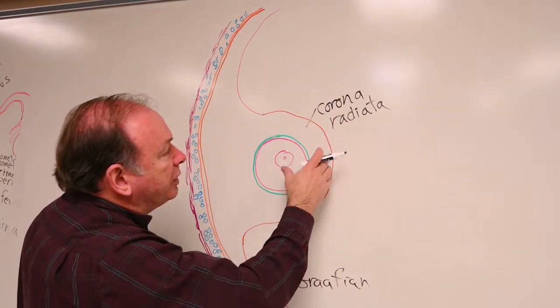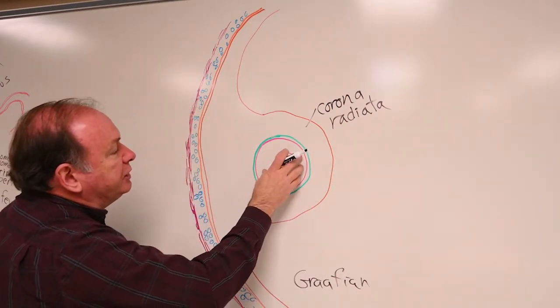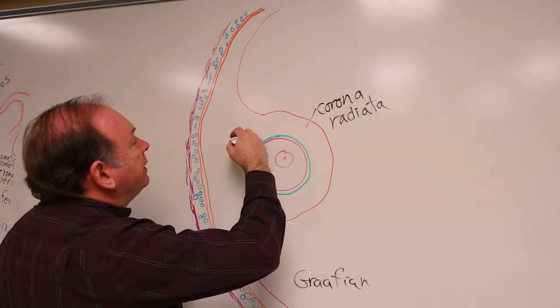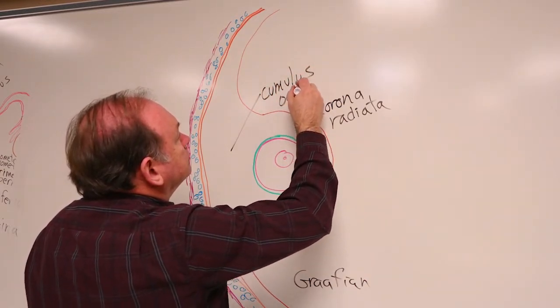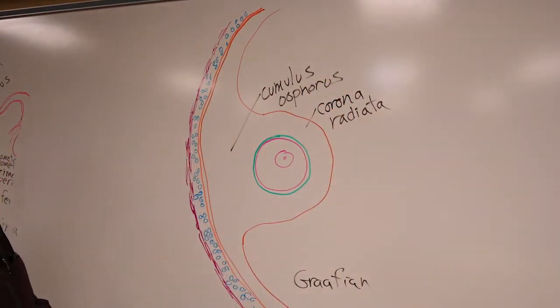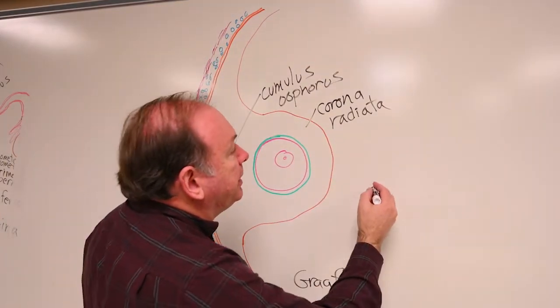That part of that structure of follicle cells they call corona radiata. That region of follicle cells that attaches the oocyte to the follicle wall over here is referred to as the cumulus oophorus. And then the rest of the follicle cells simply enclose this large antrum space out here.